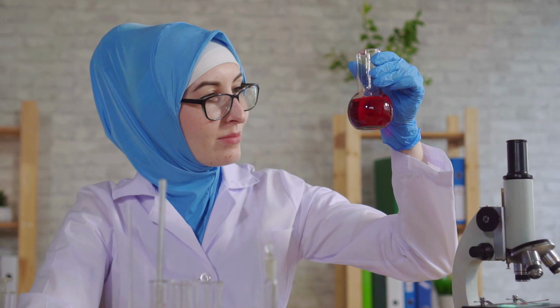We'll start with the key terms and a bit of the theory. I start out with a mixture of an undissolved solid and a liquid. In this case, I have a mixture of soil and tap water, similar to what you might find at the bottom of a garden pond. My goal is to separate this into clear water, which we'll call the filtrate, and the solid parts, which we'll call the residue. To do this, I'm going to use a sheet of filter paper and a funnel.